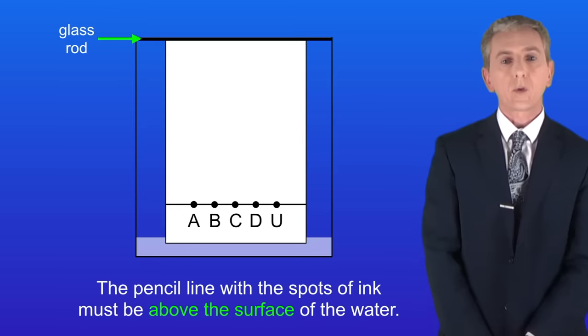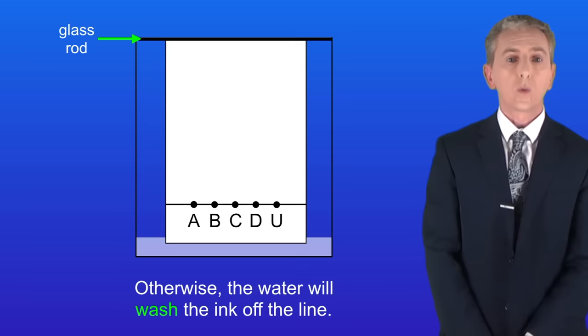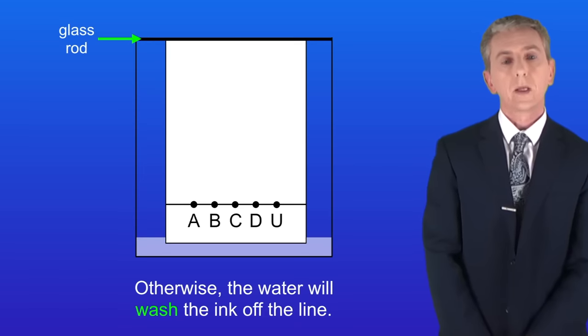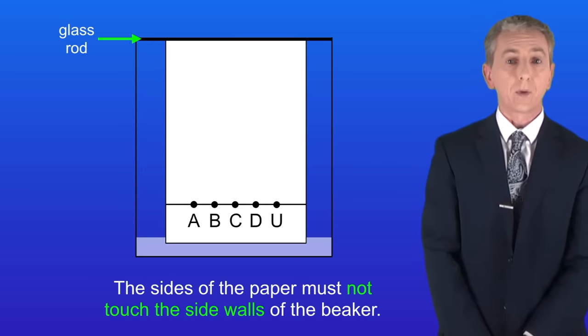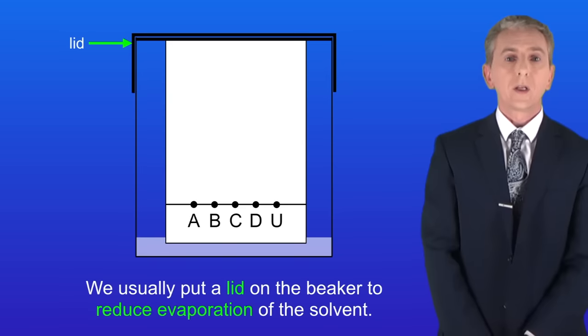Now there are three key points here. Firstly the pencil line with the spots of ink must be above the surface of the water, otherwise the water will wash the ink off the line. Secondly the sides of the paper must not touch the side walls of the beaker. If that happens then it will interfere with the way that the water moves. And lastly we usually put a lid on the beaker to reduce evaporation of the solvent.